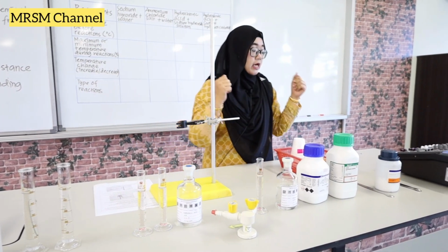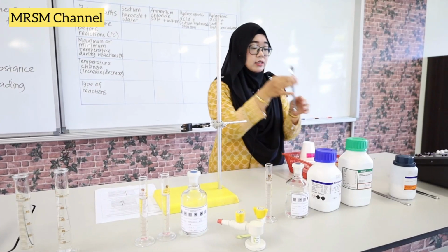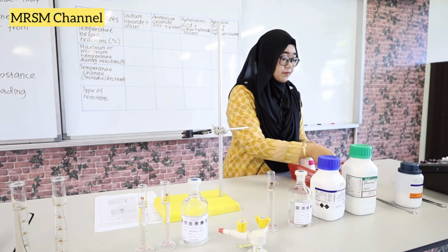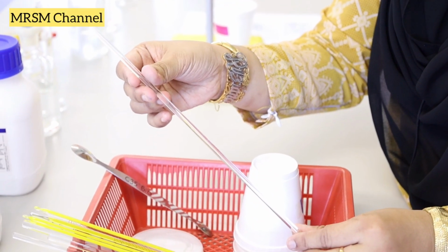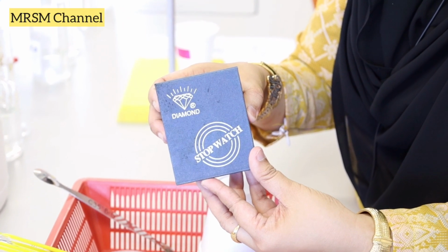Then we go to the apparatus. This is the retort stand, spatula, polystyrene cup, thermometer, glass rod, and the most important thing is the stopwatch.